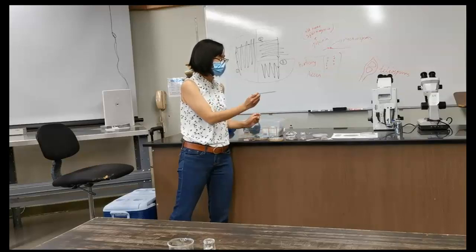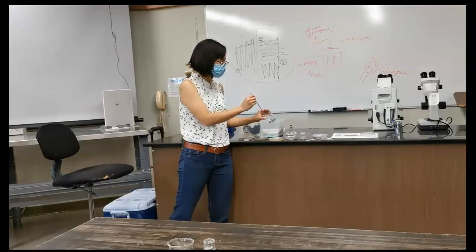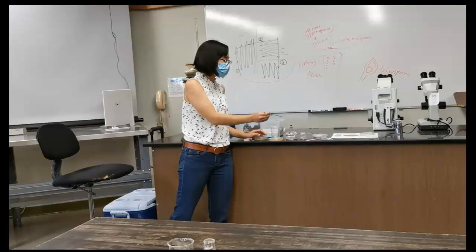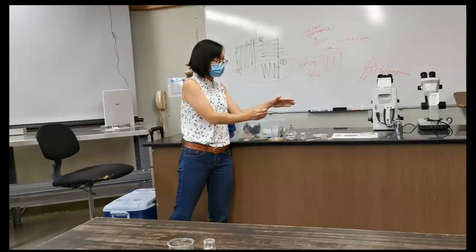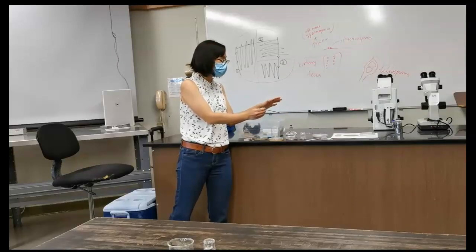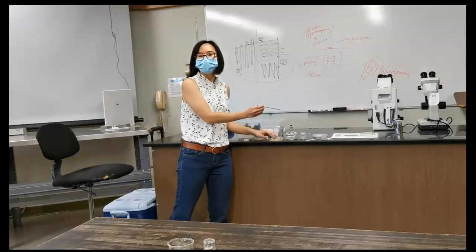So after I burn it red, then I put it in the ethanol. And then get some ethanol, dip in the ethanol, and then burn the ethanol. I'll keep the loop around the flame because that's where it is clean. Microbes are everywhere, right?